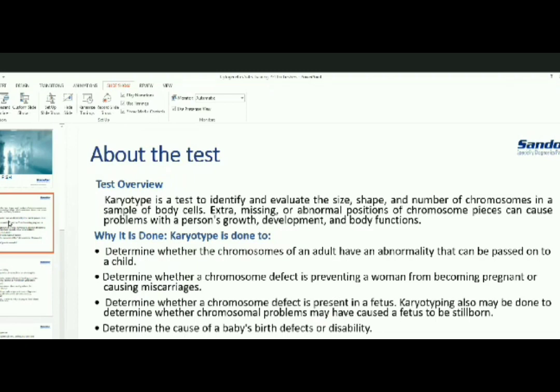And what we can detect in our karyotype is, suppose there are some kind of abnormalities, like structural abnormalities and numerical abnormalities. Numerical abnormalities anyone can detect, like if a baby has Down syndrome, 47,XX or 47,XY plus 21, an additional chromosome 21 will be present in that. That is extra, a numerical abnormality anyone can detect, but structural abnormalities are quite difficult to identify.